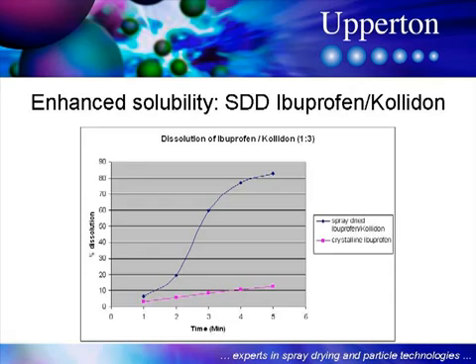What happens when the spray dried dispersion is placed in water? Well, you can see from the pink line, the drug itself, the crystalline ibuprofen, is relatively insoluble in water, showing very low levels of dissolution over a series of minutes. However, the spray dried dispersion of ibuprofen and Kollidon shows a much improved dissolution profile in an aqueous environment, as you can see from the blue curve.